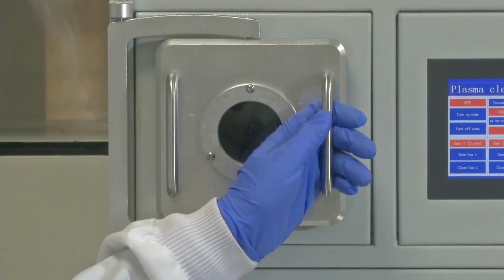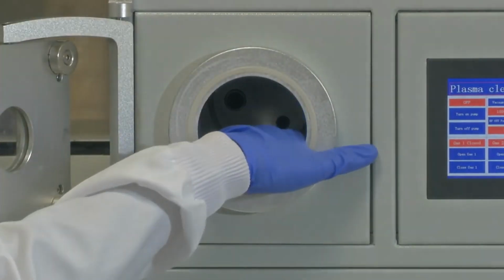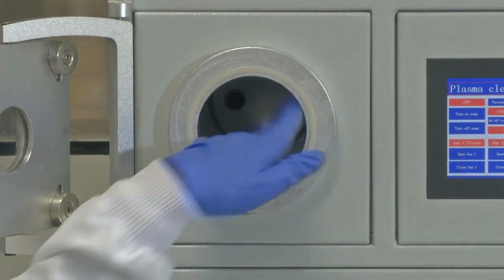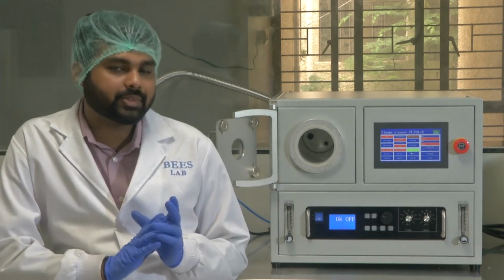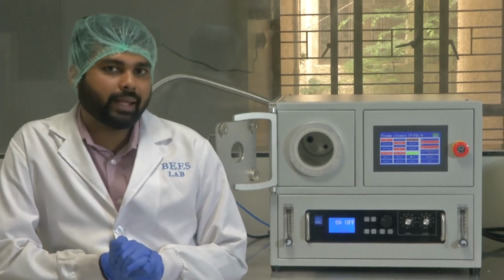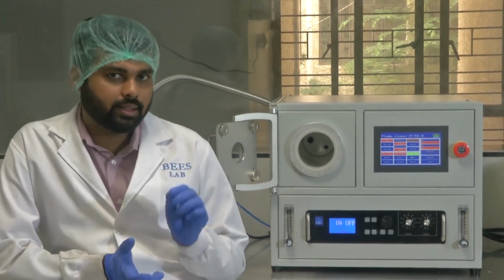Now we are ready to open the chamber, and we are opening it. We are able to open it. We can go inside and see. It will not be hot because this is RF energy. Next step, we will try to clean a glass substrate and a PDMS membrane and see if we can bond the two. That is also another application of oxygen plasma. Okay, so that we will do now. In another minute we will do that.